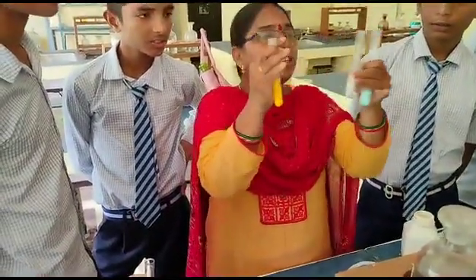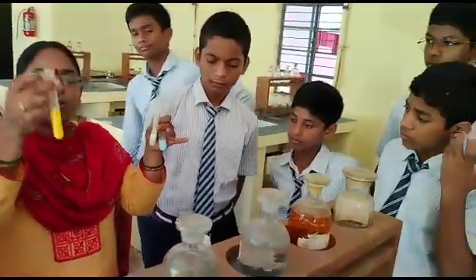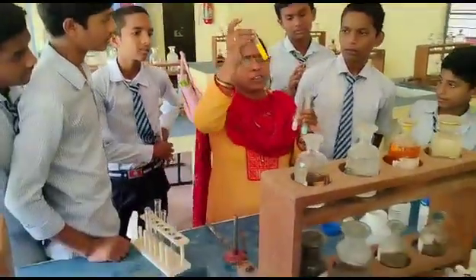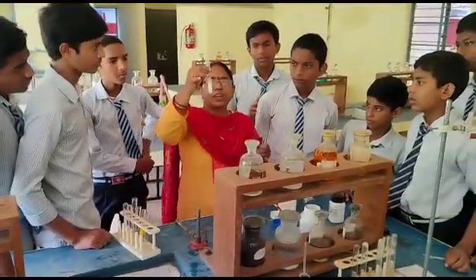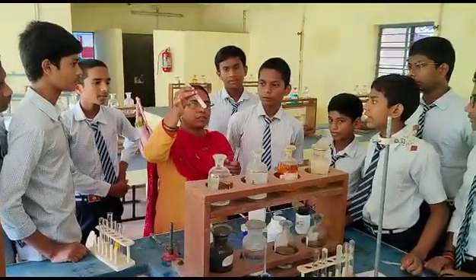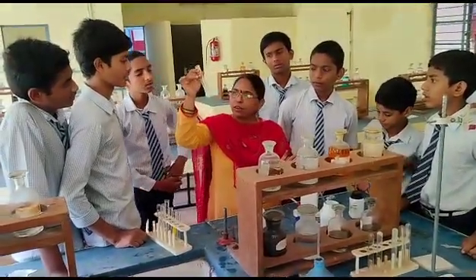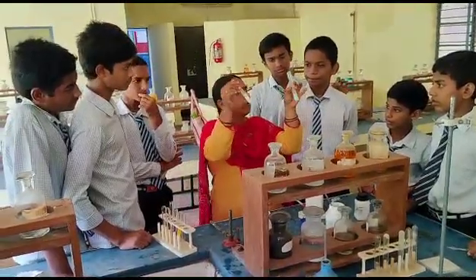But presently, whatever we have done, all the three, which reactions are they? Double displacement and precipitation reactions. In this, what did I take? Can you tell me? Potassium iodide and lead nitrate. What is the precipitate you got? Lead iodide. Okay. In this, what did I take? Sodium sulfate. What did I get? Barium sulfate. And here, copper sulfate and barium chloride. What did I get? The same barium sulfate. In both of them, barium sulfate, you know, that white precipitate.